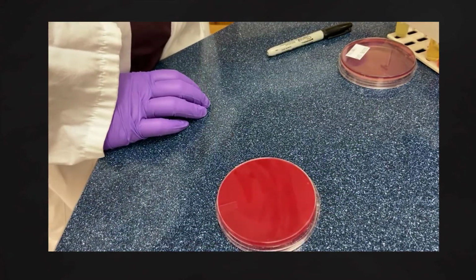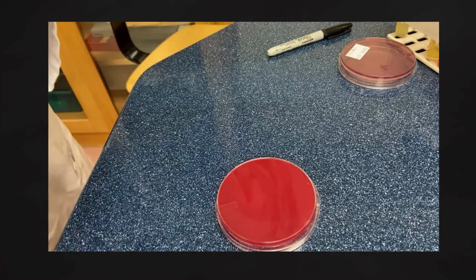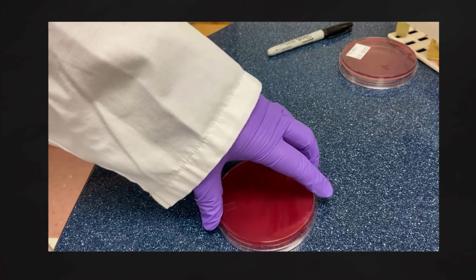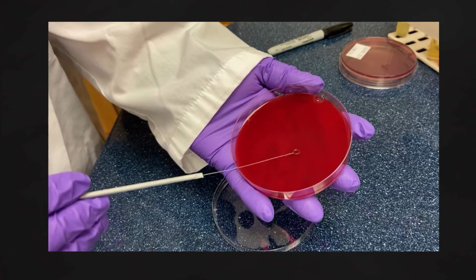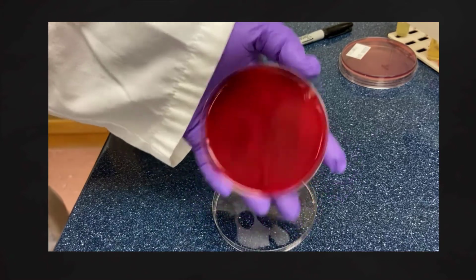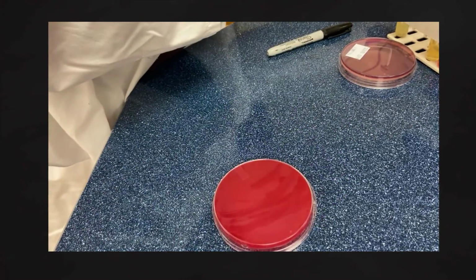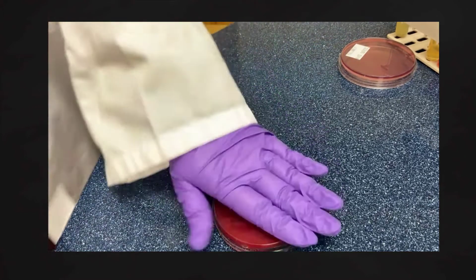Again, sterilizing my needle. After I sterilize my needle and it has fully cooled, I'm going to go from quadrant 3 into the last area available on the plate, which is quadrant 4. Being careful not to go back into quadrant 1 or 2, because again, we're trying to isolate those colonies. All right, so you see the whole plate's not covered like we had before, but we do see these zigzag streaks that are present.